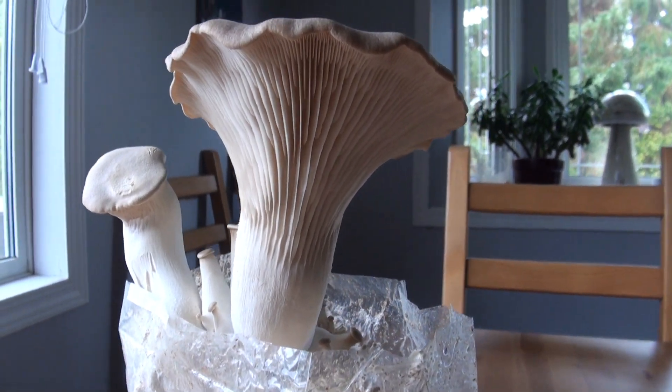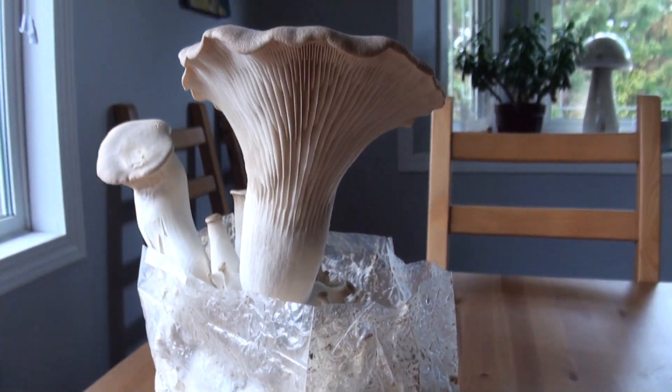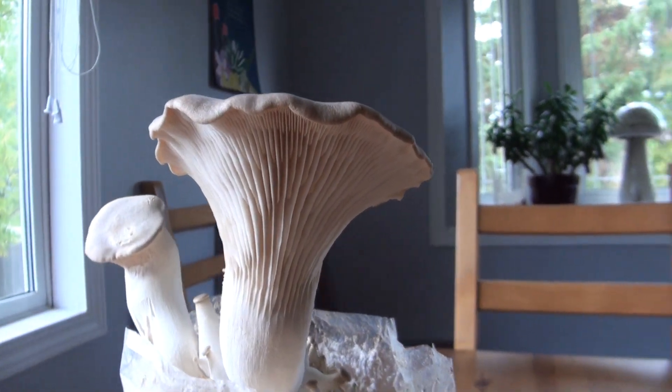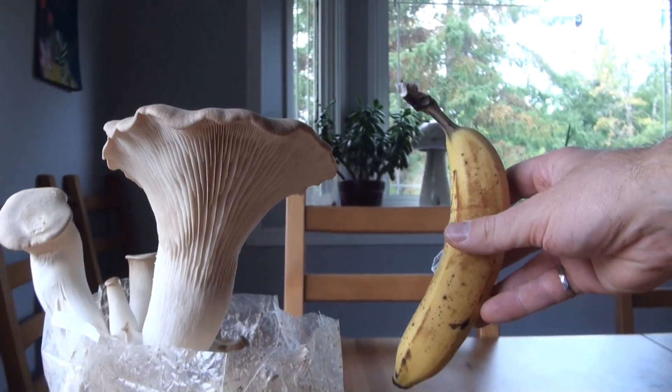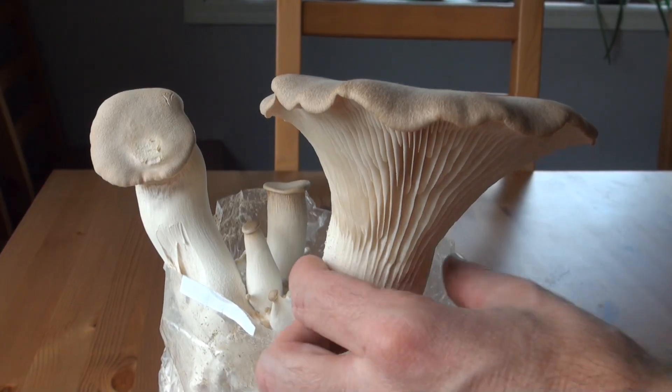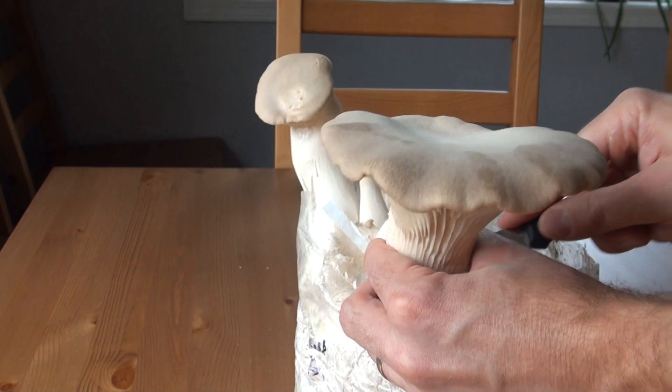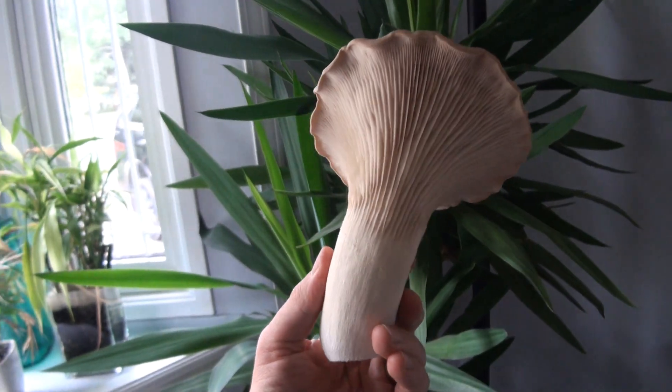So this big guy is the mushroom that we're going to clone today. It's a king oyster mushroom that's growing on master's mix and it's actually quite large. So I'm just going to go ahead and cut this mushroom off the block. I definitely let this one grow out a little bit more than when I would usually like to harvest king oysters, but that's okay because we're going to clone it and I'm not going to be eating it anyways.